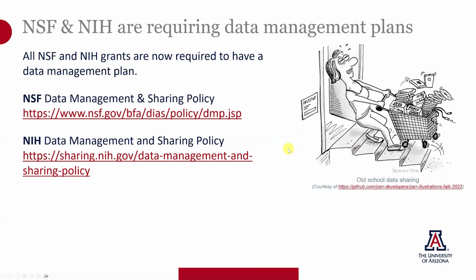And unfortunately, sharing, like this cartoon shows, used to involve a whole lot of miscellaneous storage formats. We won't even talk about zip drives and jazz drives and magneto-optical drives and floppies and all those things that go back a ways. But many of us remember, oh, we don't have something that reads that anymore.